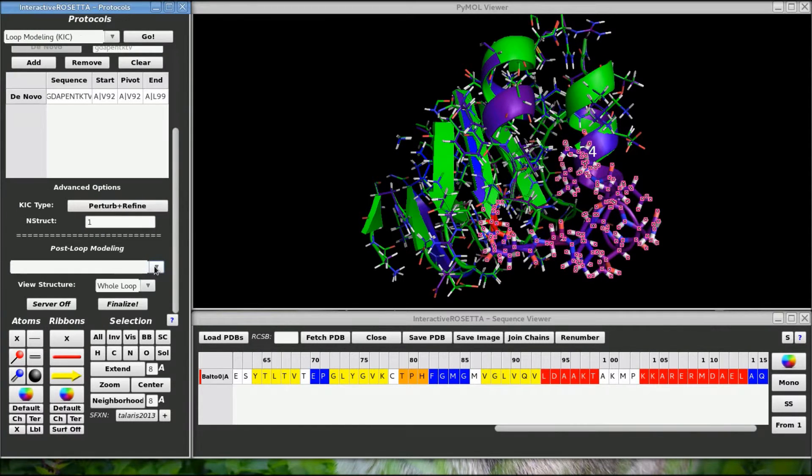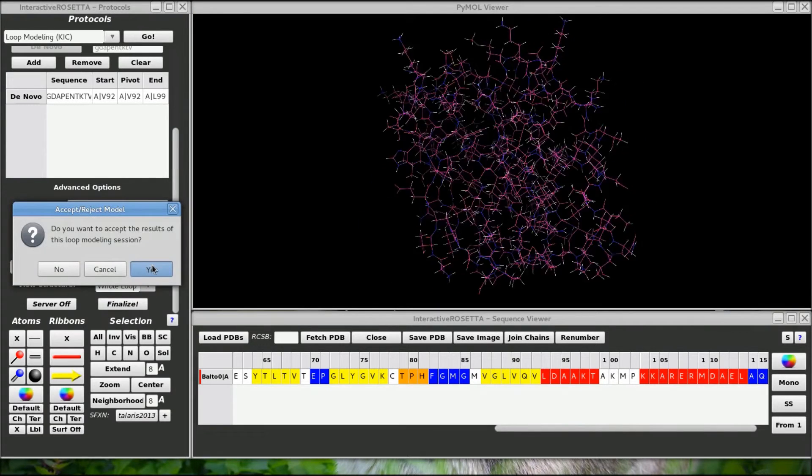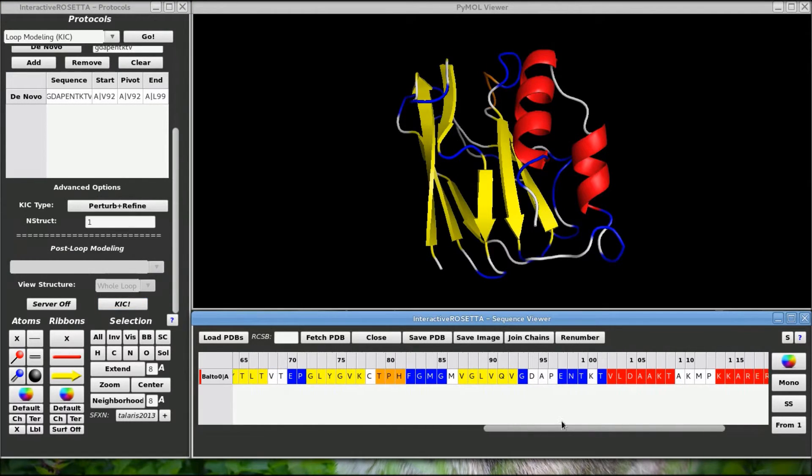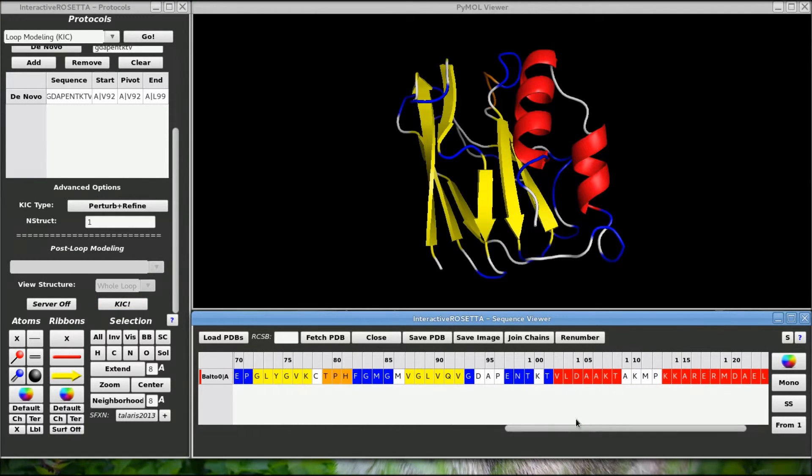This menu up here will color based on different scoring terms. Anyway, it looks good so I will accept the results of the simulation.